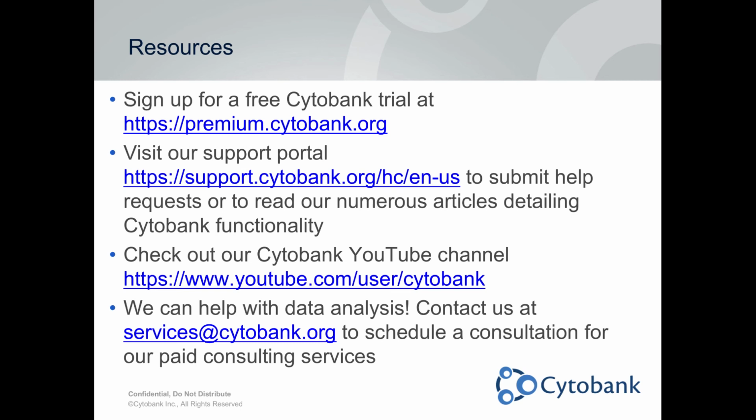So we had to use standalone versions, and basically we followed what we know. Obviously, genomic people are far better than us on these, for longer. So basically it was follow their lead and modify the pipeline they're using for gene expression data analysis, for instance, and translate it to cytometry.